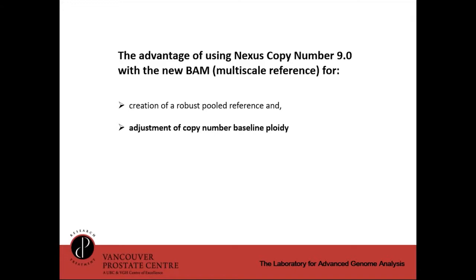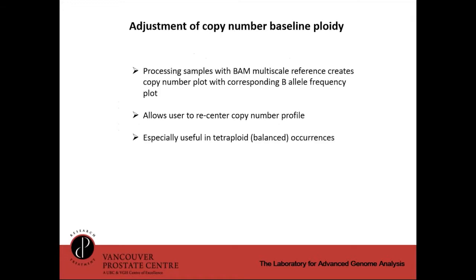So barring doing other experimentation with, say, FISH or STISH, it was very difficult to see certain situations where you've got this diploid line that has moved in some sort of direction, especially in a balanced situation. So I'll get a little more into that.